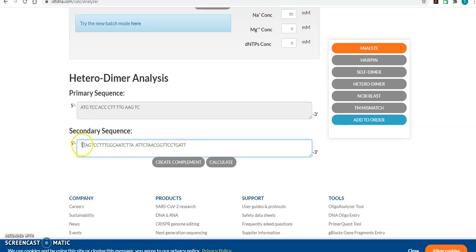I just typed up that sequence based on the sequence you can get from the opposite side, TTA, GTC. See, that's what I typed up, so you can get rid of that. Okay, so now that's the correct sequence in the correct orientation, right?